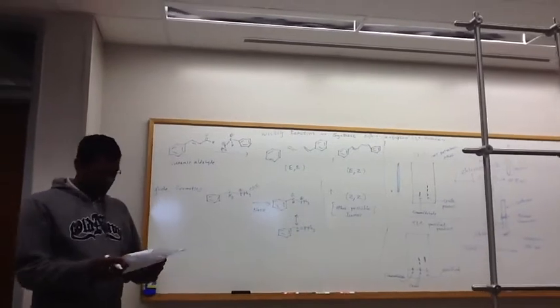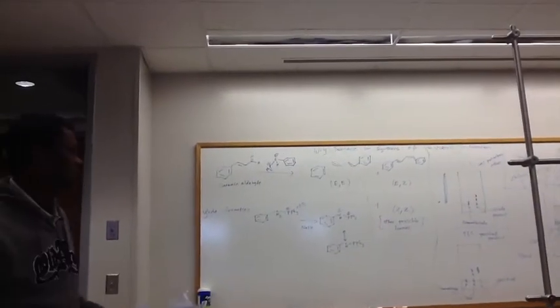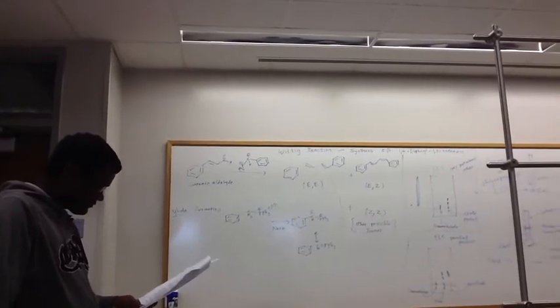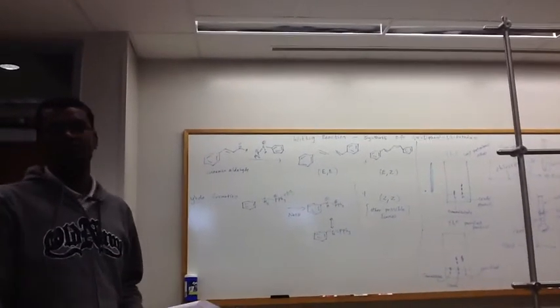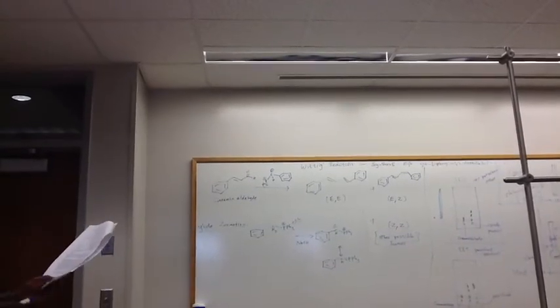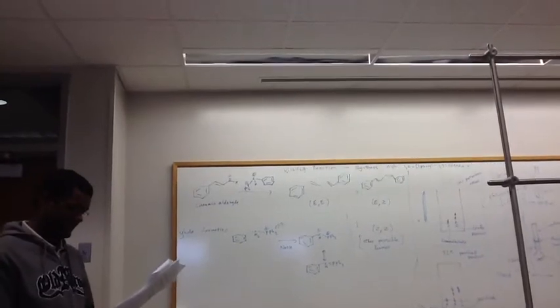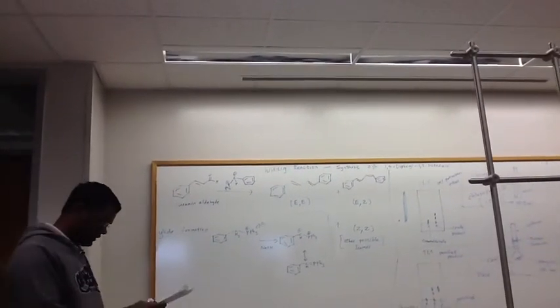So in the proton NMR you have to look for your signals for the EE isomer, right? You can see the differentiation between EE and EZ. The explanation is given in the handout. So let's say we got the proton NMR.